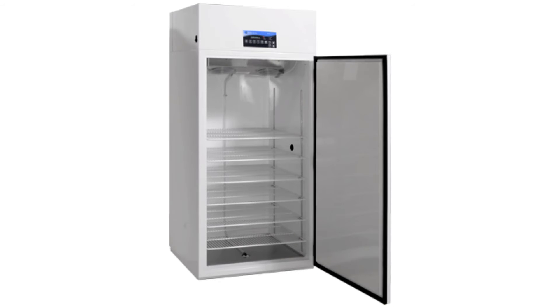I almost forgot to tell you! The entire robot fits into a standard incubator in order to keep the temperature constant.